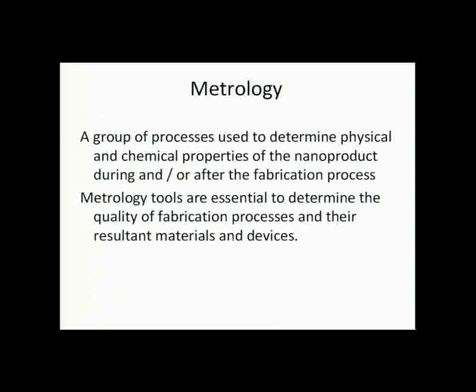Let's start off with a basic definition of metrology. Metrology is a group of processes used to determine physical and chemical properties of the nanoproduct during and or after the fabrication process. Metrology tools are essential to determine the quality of fabrication processes and the resultant materials and devices.